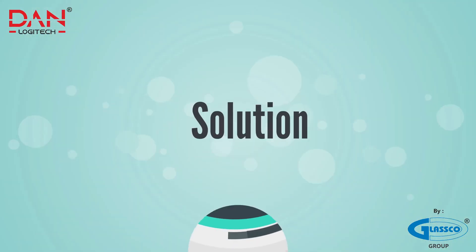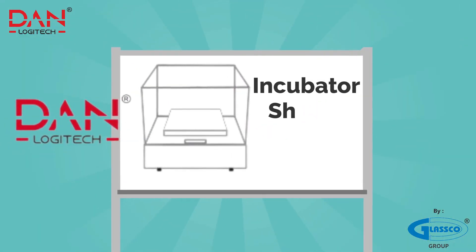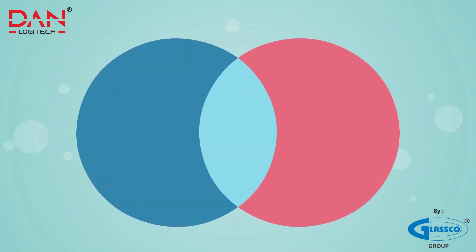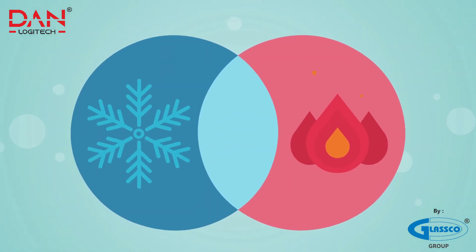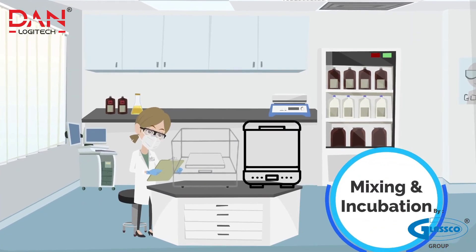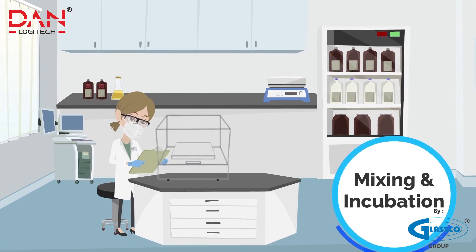Your perfect solution is right here. Introducing Dan Logitech's incubator shaker with cooling by Glassco Group. This two-in-one incubator shaker comprises heating and cooling. Dan Logitech's incubator shaker is designed to mix and incubate liquids simultaneously, eradicating the need for an external cooler.